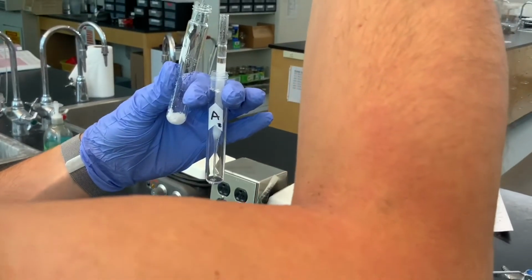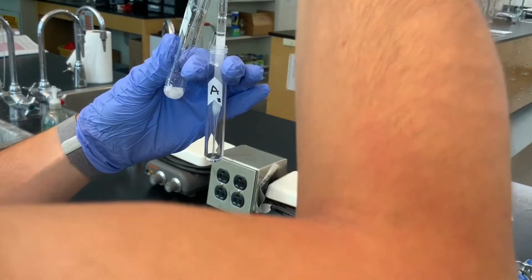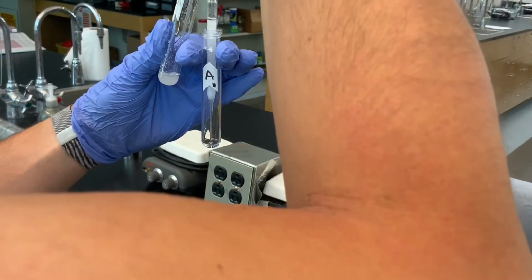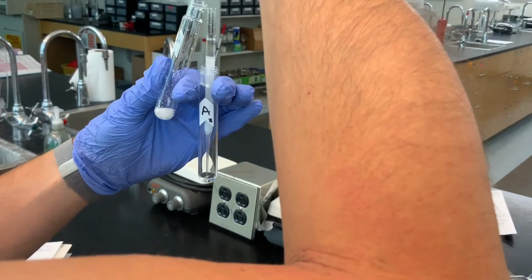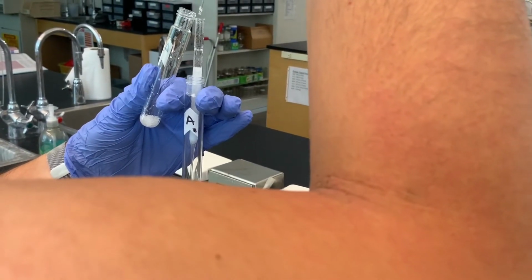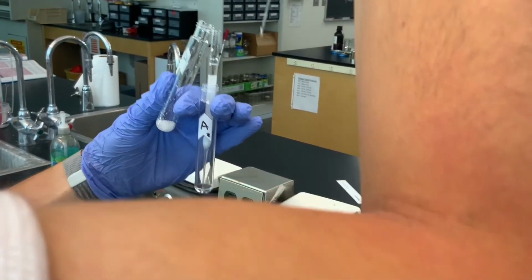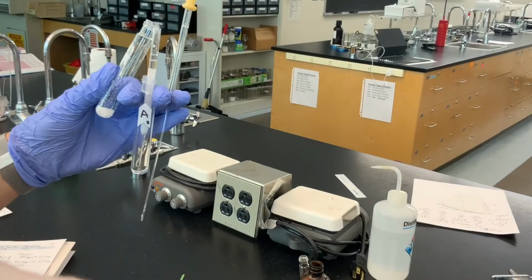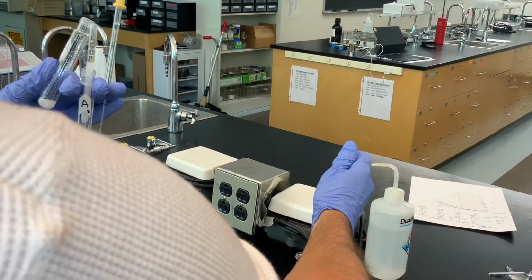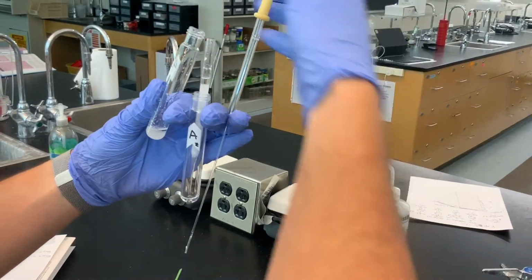You can even draw it up and then rinse the sides of the culture tube with the methylene chloride to be sure that you've gotten all of the benzoic acid. And then now for the third wash, because we're being so thorough.